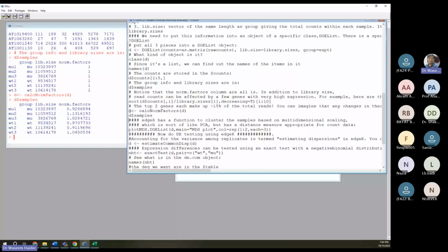So every number here, if it is 1, it will be taken as 0.92. Here the numbers will be slightly increased, here decreased, decreased, a little bit increased. Why is it doing that? It's going into each column, looking at all the numbers in each column and their means and standard deviations, and doing some calculations. That's its own method of normalization, so we ignore that. Right, so now everything is set.